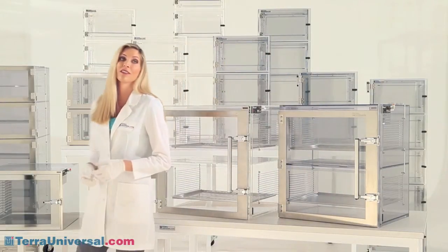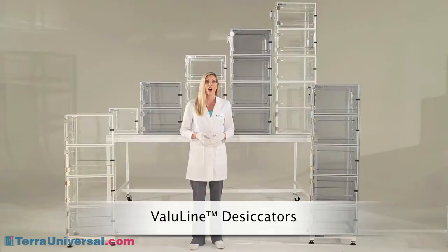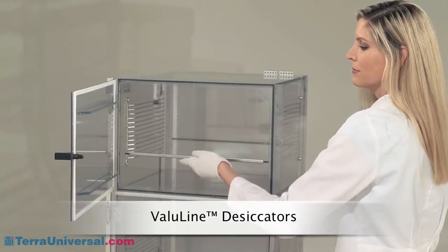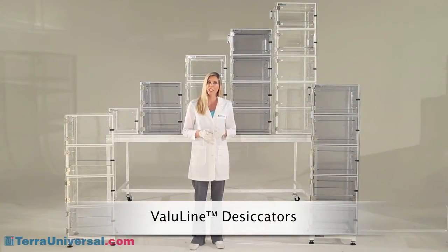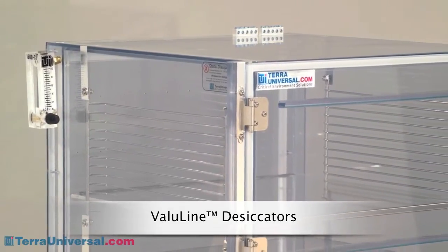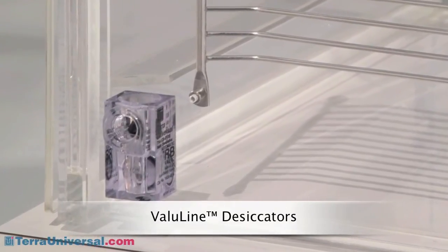Now we're ready to look at specific desiccator styles. Terra Universal's value line desiccators provide value without compromising performance. These cabinets come with one to five chambers in both acrylic and static dissipative PVC, and incorporate features to extend durability and cleanliness. Compression-style lifting latches securely seal the reinforced door against closed-cell gaskets. Cabinets include chrome-plated wire racks for adjustable shelf positioning, with optional shelves in reinforced acrylic or perforated electro-polished stainless steel. Value line desiccators are shipped as turnkey systems — all you need is a connection to a nitrogen source. Nitrogen enters through a flow meter, and a plenum chamber ensures uniform gas distribution. Nitrogen displaces moisture-laden air, which exits through a Terra relief bleed valve at the bottom of the chamber.